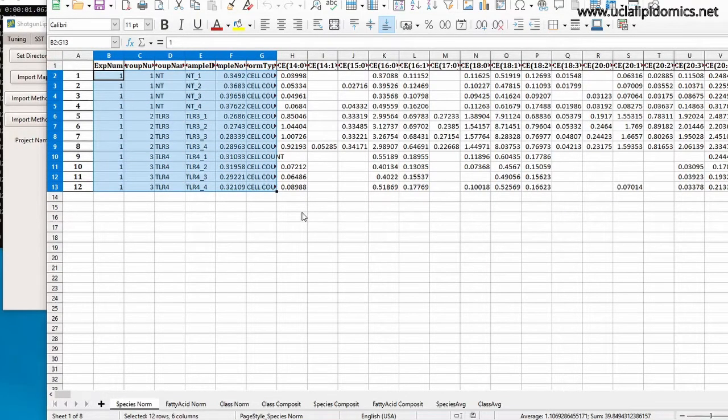Lipidizer users will be familiar with several tabs seen below. The concentration tabs have been replaced with normalization. These are the quantified values normalized to the user-specified normalization value. In this case, that would be nanomoles per 10 million cells.